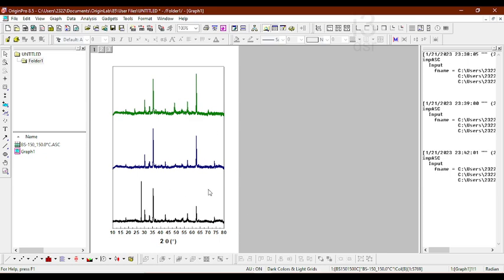So now everything is done. When I see this data, this is my data. I could see that the first peak, which is around 25 to 30, around 27, disappears in the rest. So this is one significant thing. The second thing which I could look at is these 2 pairs of peaks, which remain the same at these 3 peaks. I'll say what is the modification later on.